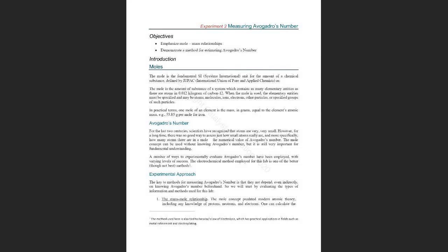Hello, how's everybody doing? Today we will investigate experiment number 12 in Labflow, which is measuring Avogadro's number. I will give you a quick overview of the experiment, and then I will share my Excel page to show you how to do the calculations.